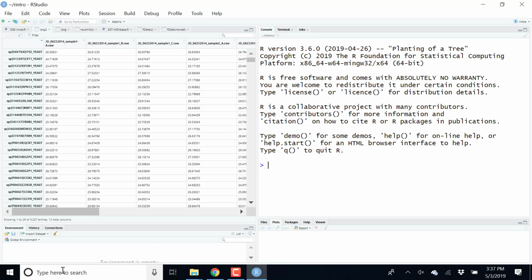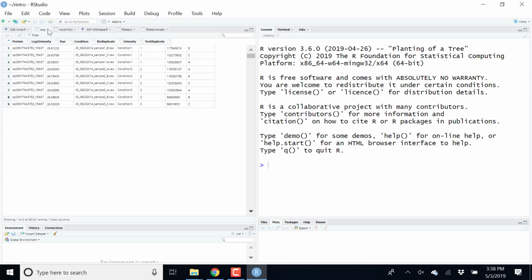Then we are also going to look at one of the basic tests, the t-test. We will see how to use the t-test function for one specific protein, and then how we can apply this method to all the other proteins. And if time allows, we get to sample size calculations.